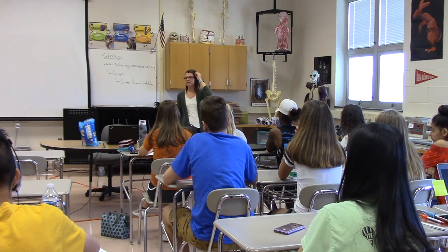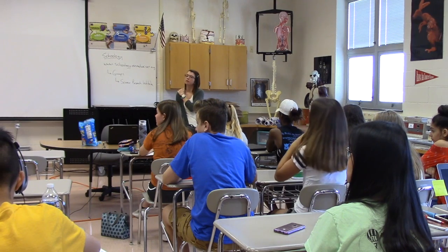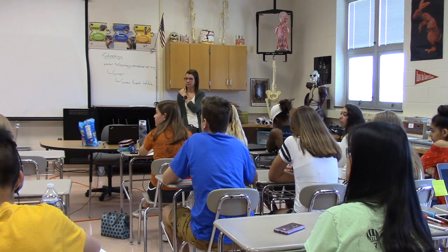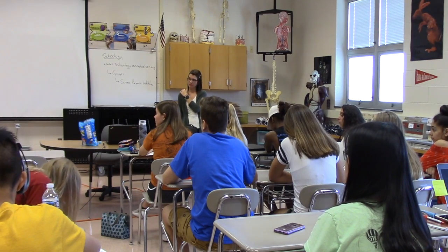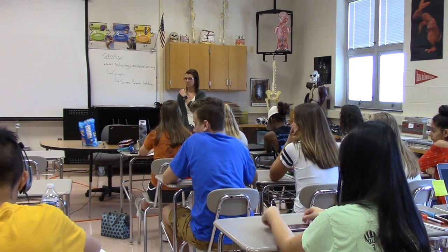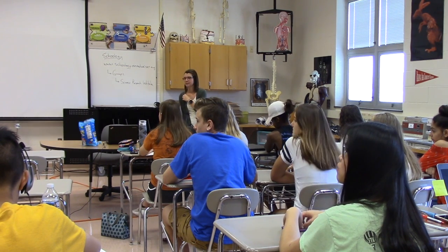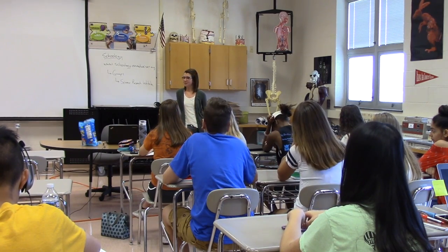Do you guys do any ELISAs yet? We've used ELISAs for a couple projects, one was looking for gluten sensitivity. But we can do ELISAs between Western blots if we have the ability. I haven't used that since college, and I've never done a Western blot.